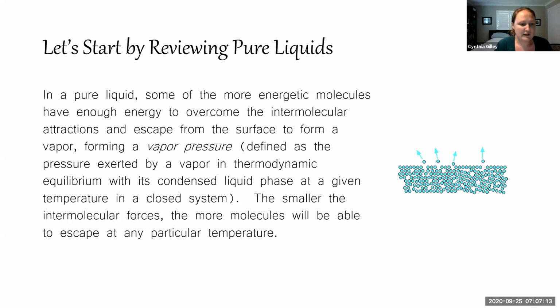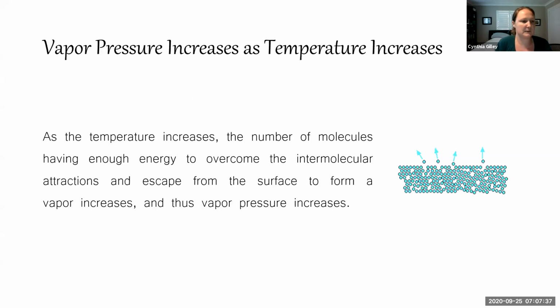The weaker the intermolecular forces between the molecules, so for example, between the two blue molecules here, the easier it will be for the molecules to escape and go into the gas phase at any particular temperature.